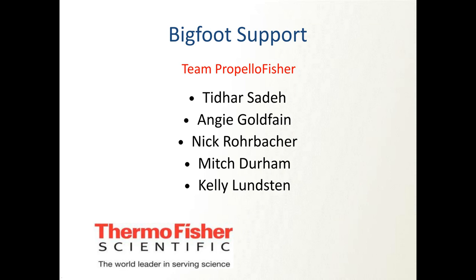And as I said before, we went big. Original first replicative experiments were 23 and 24 color, and that's a lot. And as you start looking at little variances in that, you're not sure, is it panel design issues? Is it one machine or the other? And we're trying to unravel this stuff, because we are seeing differences. In some cases, I'm seeing bigger spreading in some channels on the Auroras, and I'm not seeing it as bad on the Bigfoot. In other cases, I'm seeing stuff that's not as bright on the Bigfoot that looks great on the Aurora. So it's come to the conclusion that it's kind of an apples and oranges situation.